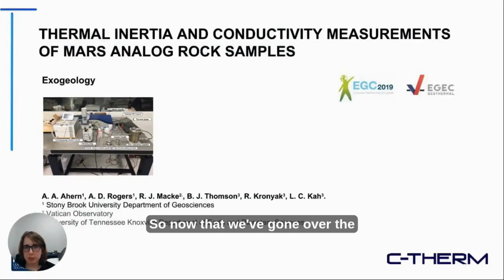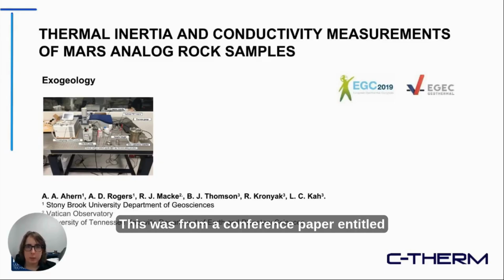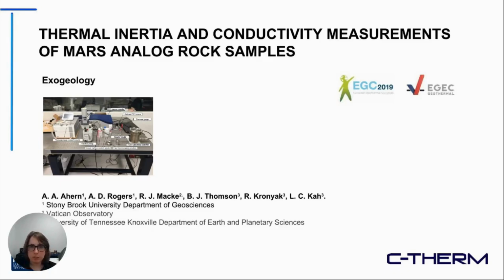So now that we've gone over the basics of the technique, we'll look at a few different application highlights. The first one is looking at some work out of Stony Brook University. It's looking at an exogeology type of application. This was from a conference paper entitled Thermal Inertia and Conductivity Measurements of Mars Analog Rock Samples.